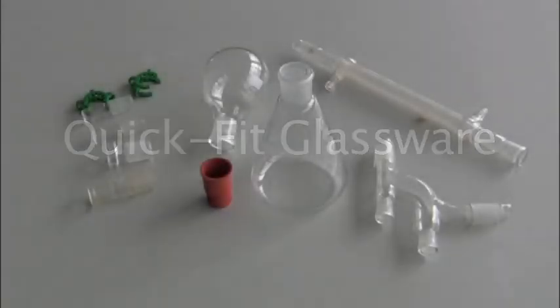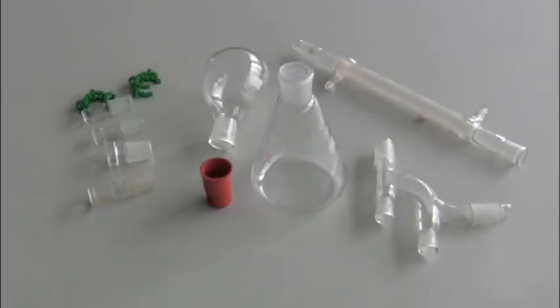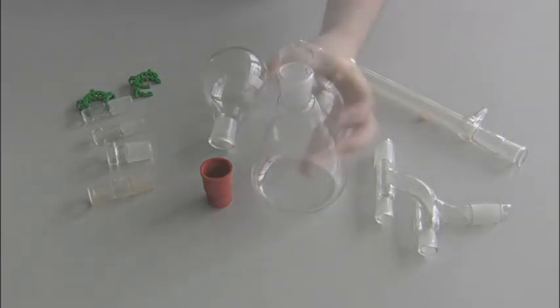In this video, we will look at Quick Fit Glassware. Quick Fit Glassware comes in many shapes and sizes. Here we see some stoppers, clips, a super seal, different kinds of flask, a condenser, and a still head.